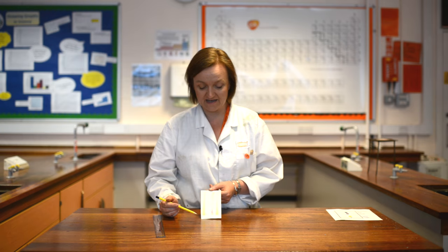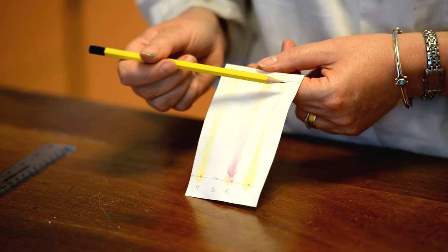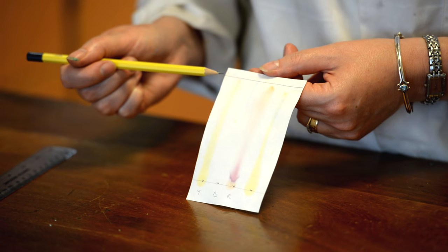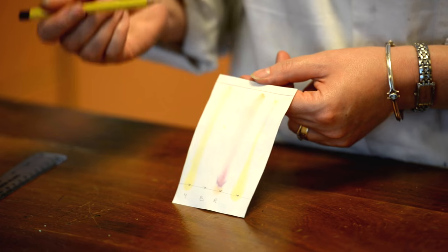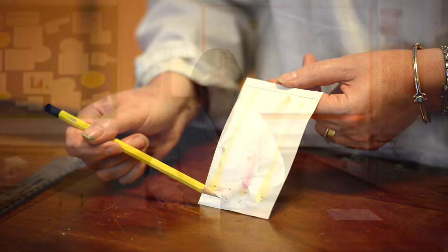So we have left the chromatography in the solvent for about 15 minutes, and the water has made its way up the paper. You'll see I've also put another pencil line now near the top of the paper, and this is the distance that the water traveled. I've taken it out, I've let it dry, and now we can look at the three known food dye colors and compare it to our unknown.